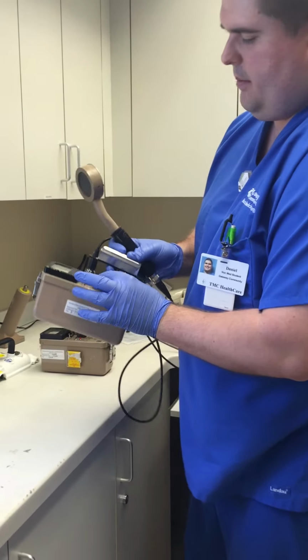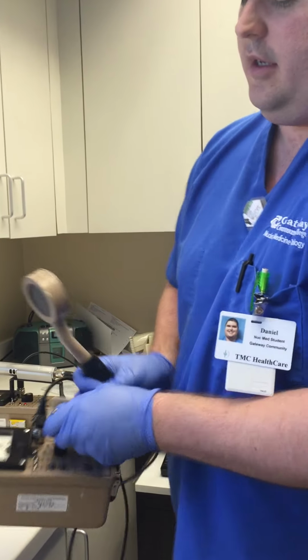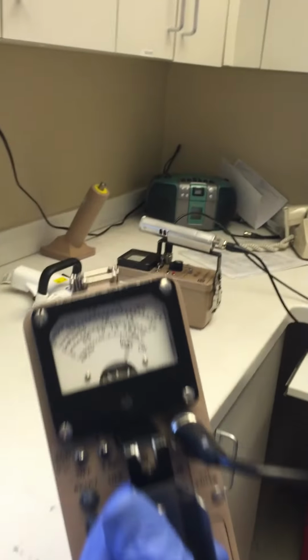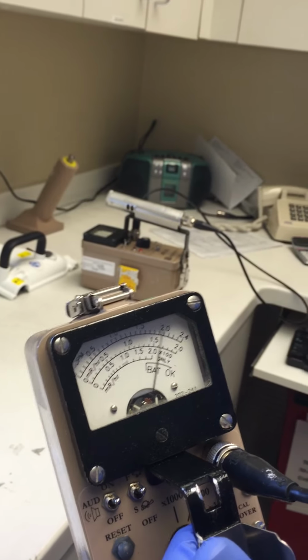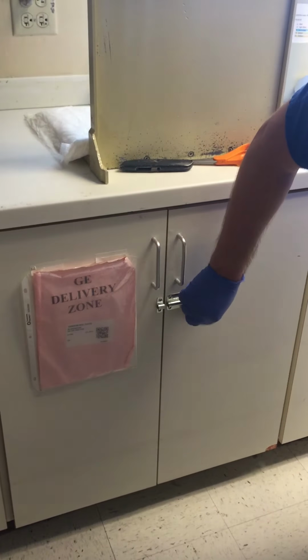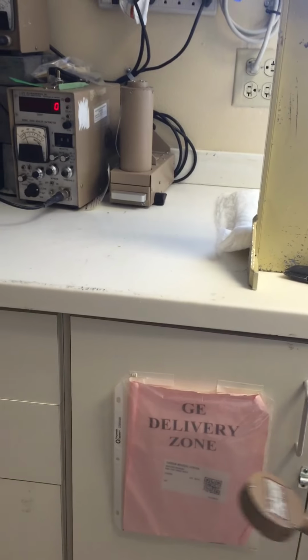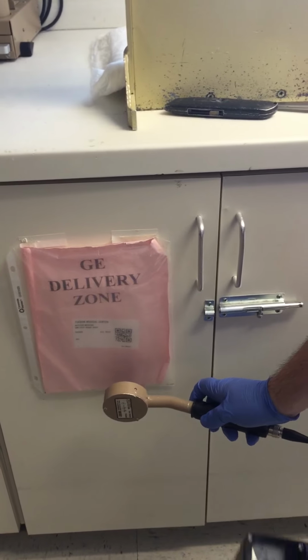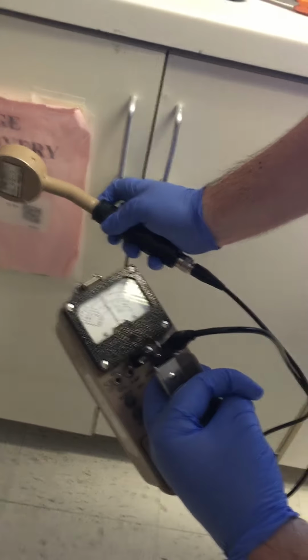So I'll do a quick demonstration of what this sounds like and looks like. So if we just turn it on, you'll see the needle moving, and you'll hear the sound based on how quickly the needle moves. And so this right here is actually shielded, and it has materials that were decaying. So you can see the metal here. And so if I just put this right here, you can see the needle moving, and it's detecting radiation from that.